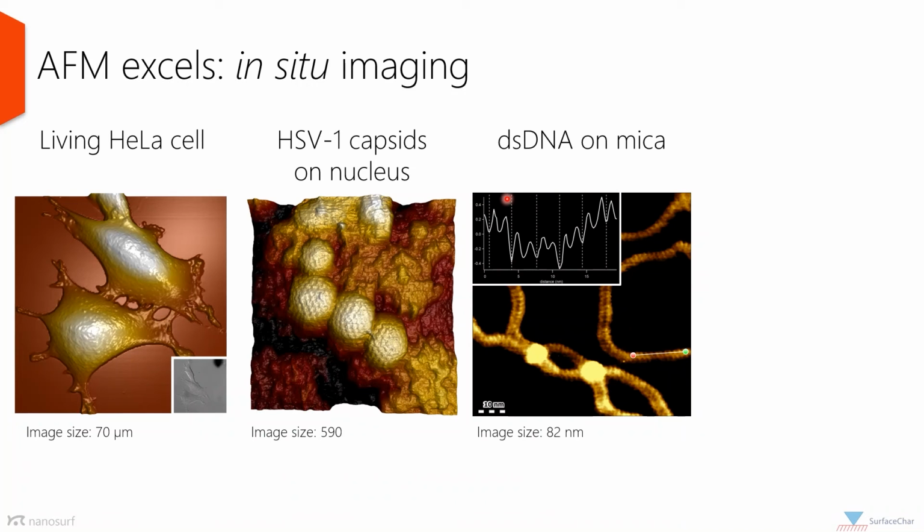If we measure the periodicity between every second valley, for example, we see that this corresponds to 3.4 nanometers, which is exactly the pitch of a helical turn in a double-stranded DNA molecule. And this means that with this stripe pattern, this banding pattern, we basically see the major and minor grooves of DNA.